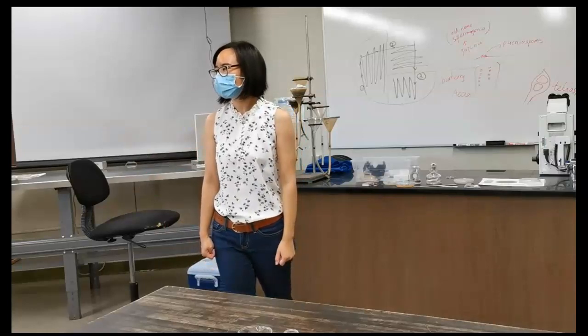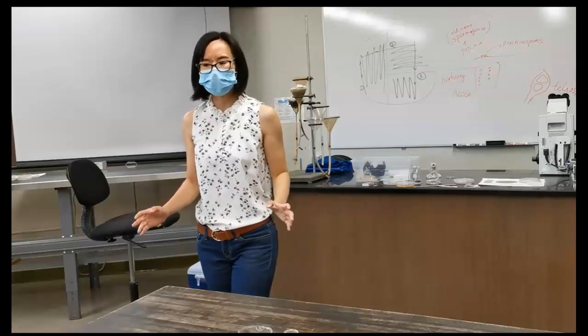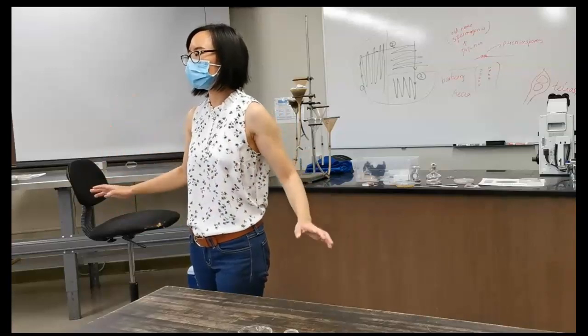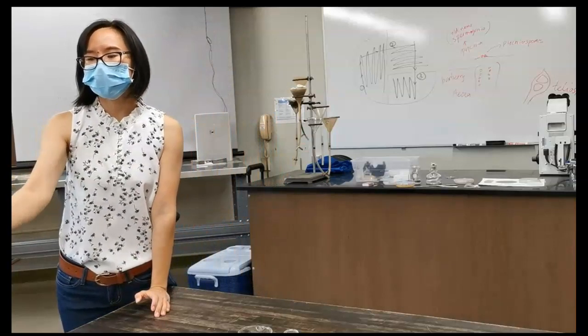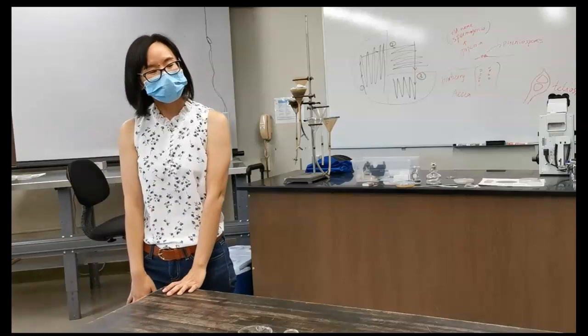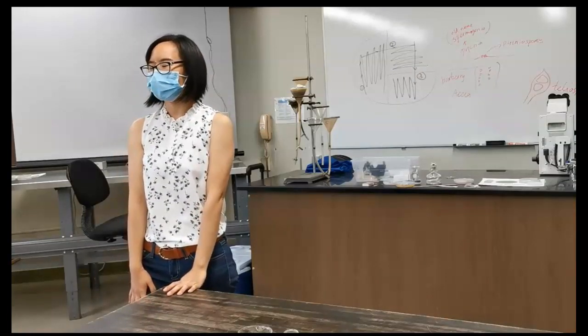How's that? Great. I think that's that for demonstration, and you can get started. And while you do your work, I'll call your names, and you can start to do observation of the samples in the middle bench. Questions? Okay, let's get started.